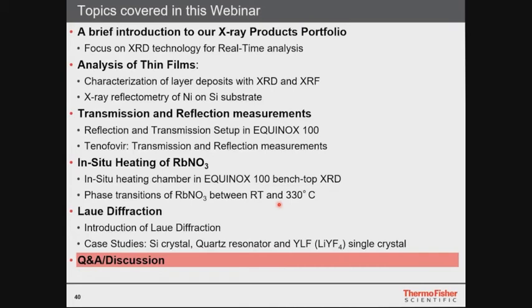Some samples are very sensitive to heat or to pressure, and you will change them. But then you can try to measure them as is, but sometimes this will yield not that nice diffraction patterns. But then you have to live with them because there is no solution. You also have to be careful with ball milling, because upon ball milling you apply a lot of heat and pressure, and you could change the sample. So it really depends on the sample, and you have to be careful.